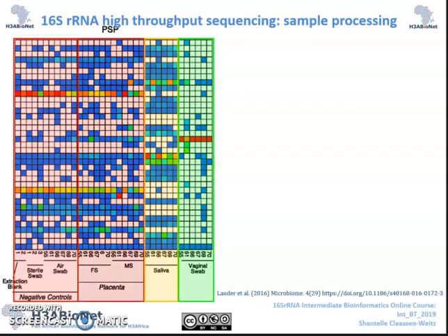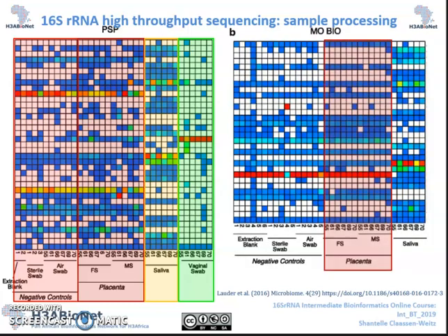However, placental sample profiles were very similar to the profiles from these negative controls. Of note, they confirmed these findings using two different DNA extraction kits. Hence, the placental bacterial profiles may not represent that of a biological specimen at all, but only reflect background profiles from either the storage buffer used or the reagent used during DNA extraction and PCR.